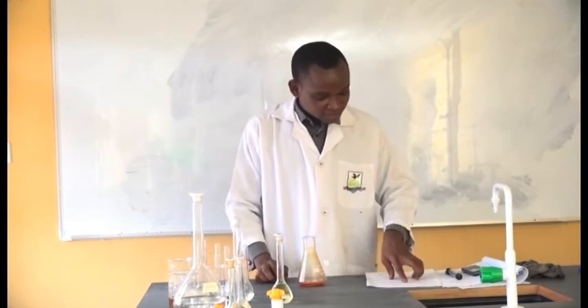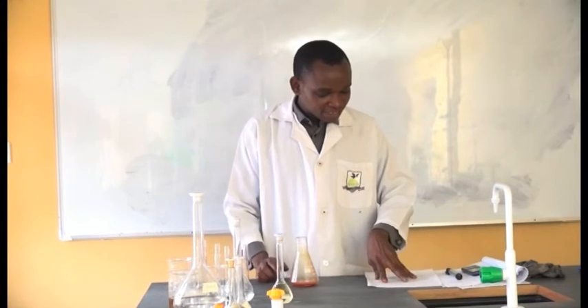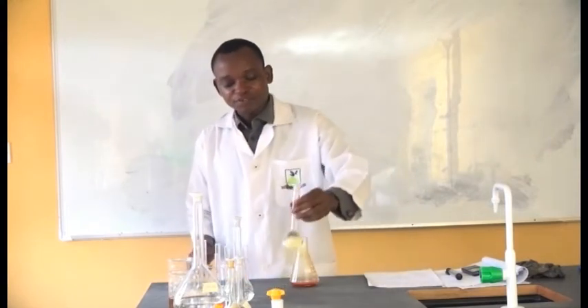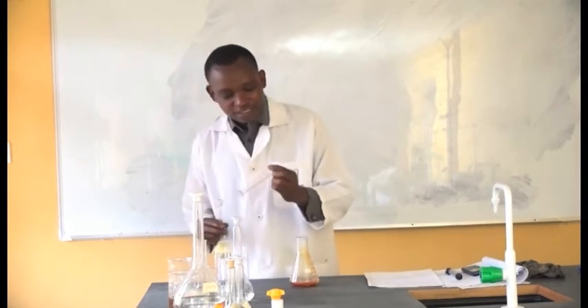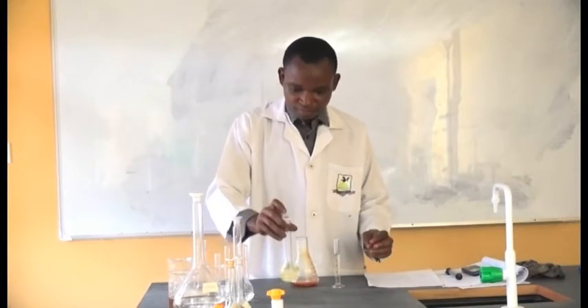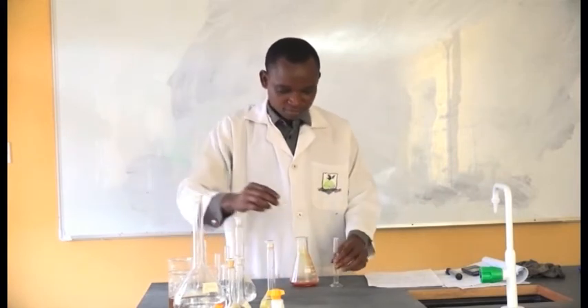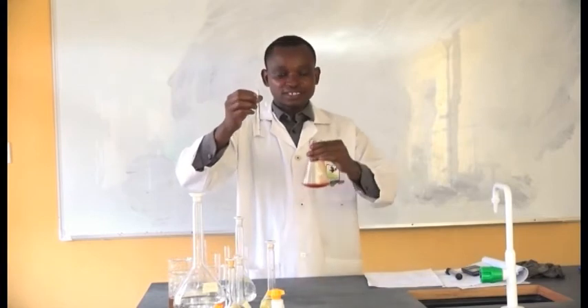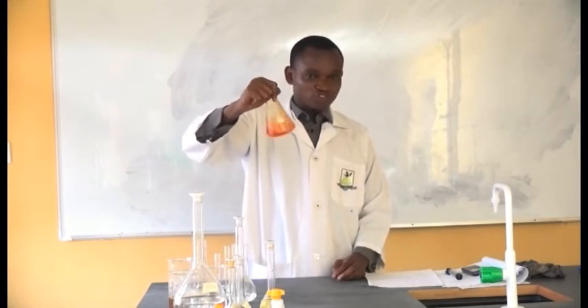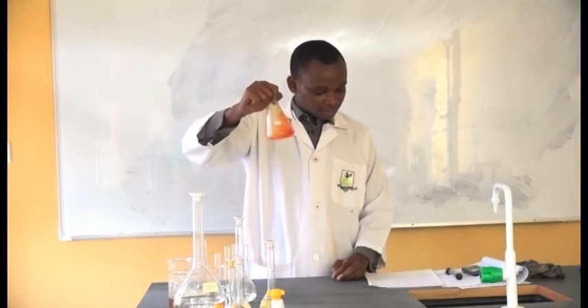After 30 minutes, remove and add 10 ml of potassium iodide. We have 15% potassium iodide. I'm going to measure out 10 ml and add it into the conical flask, then shake well.